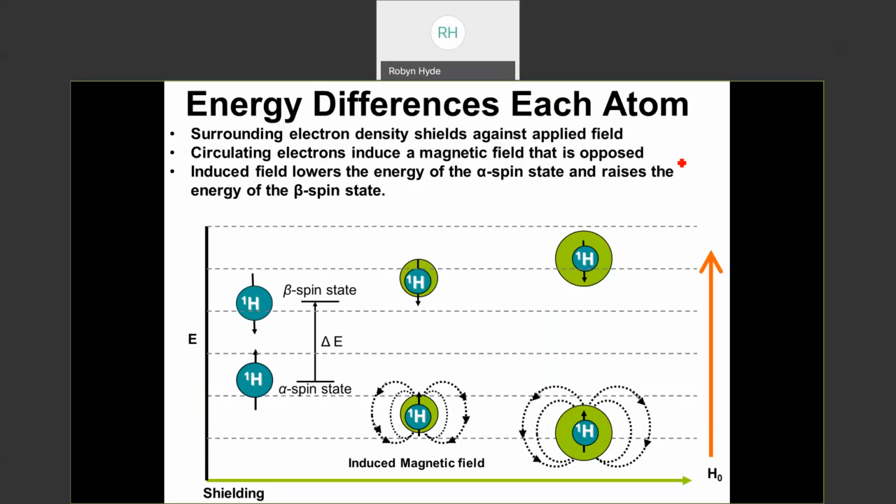As we start literally looking at a chemical, what this means in an actual chemical. So a way that you can think about it is, it's pretty cold outside. So what if you were all sitting here in your swimming suits? And I said, okay, field trip. I want all of you to go outside and to stay as long as you can until it's just too much cold and you have to come rushing in. And so delta E, think of that as being time outside.